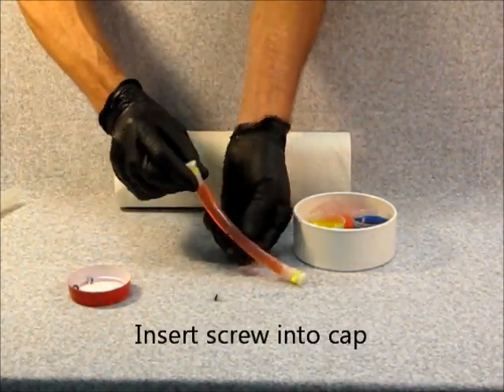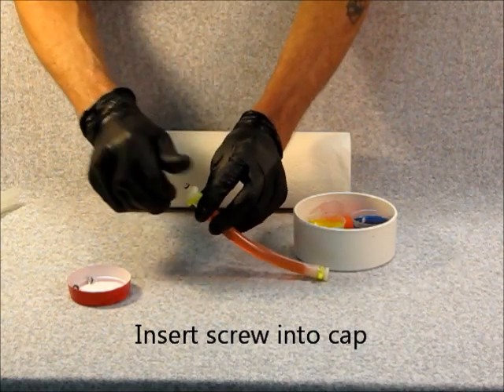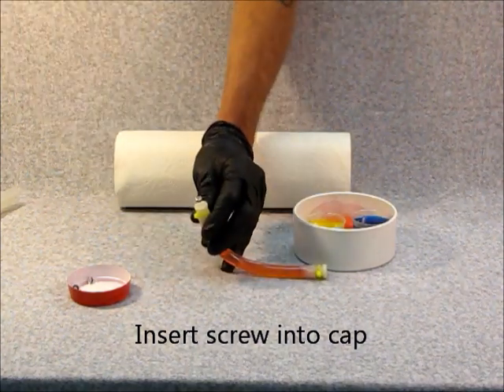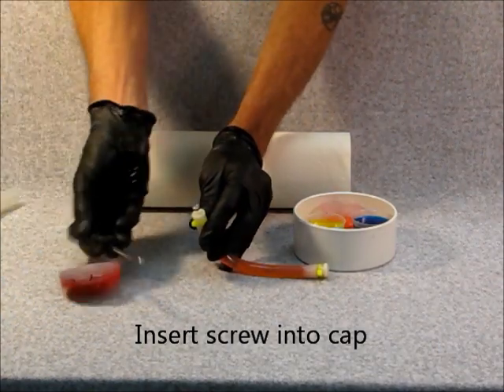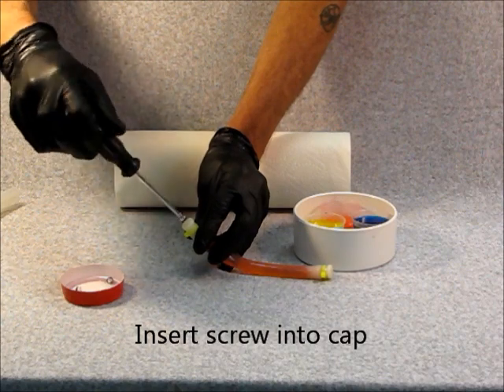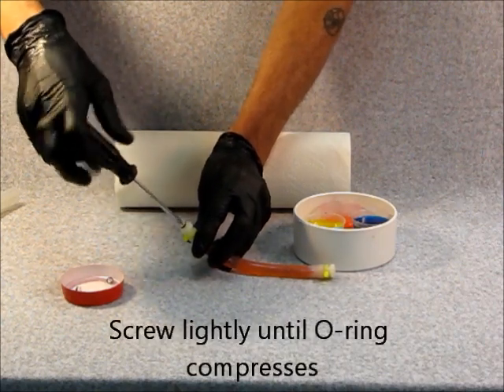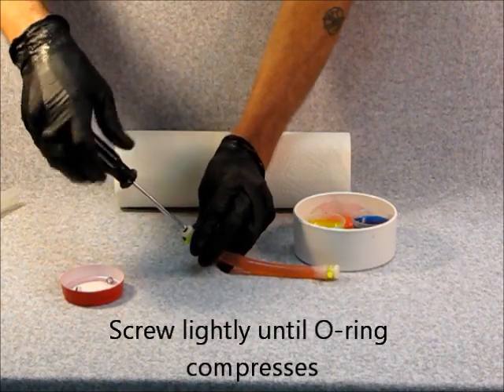Take one of the screws that was included in your kit and insert it into the hole in the end cap using your hand. Tighten it softly with the Phillips screwdriver until the O-ring is compressed.